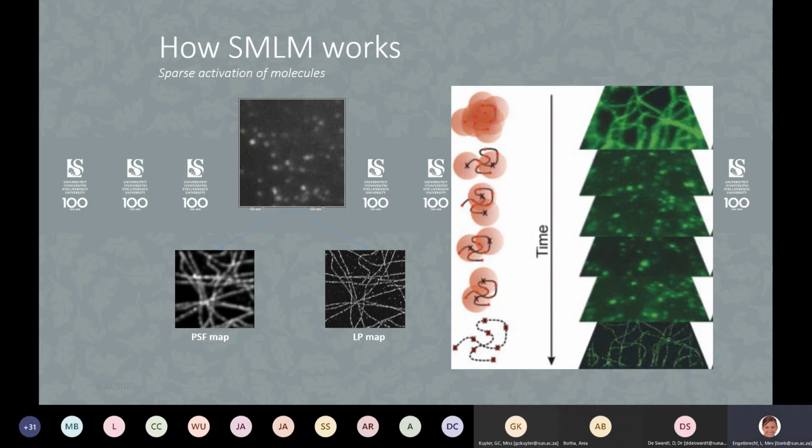So the way of imaging, you would have your sample. In some cases, you'd have a lot of fluorescence in the beginning, especially in STORM, but eventually you switch all of the fluorophores off. And then sequentially, you start switching on some fluorophores, this one and that one first, to the point where they are switched off. Eventually, these two would switch on, then those two, eventually those two, and right at the end, you would have a localization point for each of the fluorophores that was on during your video.